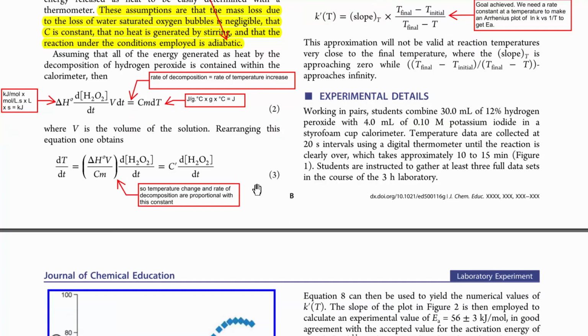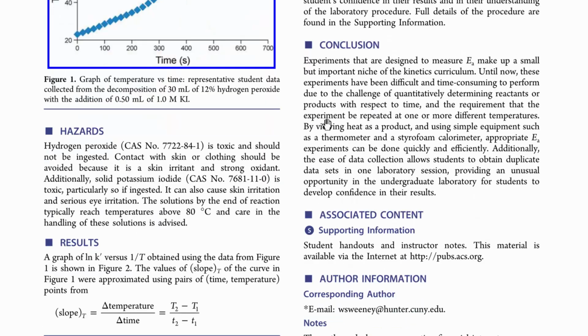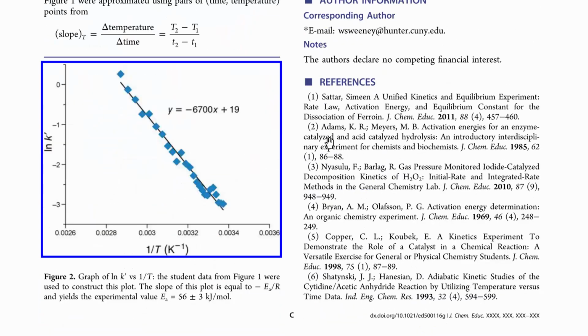This one here is just now playing around with that. So it's good to jump to our end product. Now, hopefully you've done the lesson, so you know that to work out the activation energy, we're going to use an Arrhenius plot.